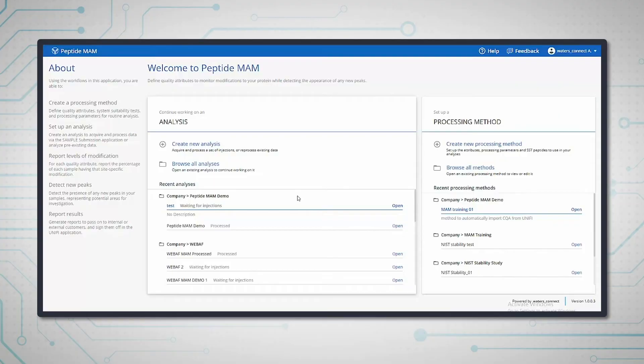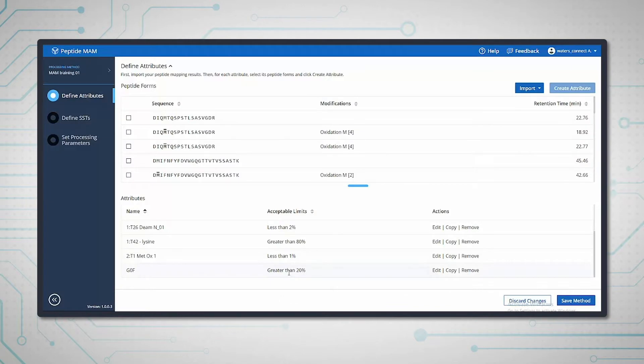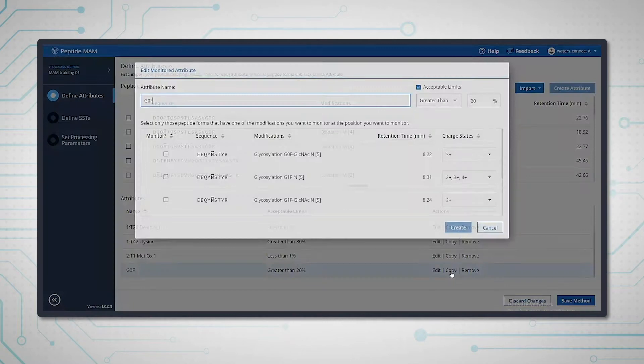The app enables scientists to easily create Peptide MAM experiments and interpret the results clearly so they can make informed decisions quickly and with confidence.